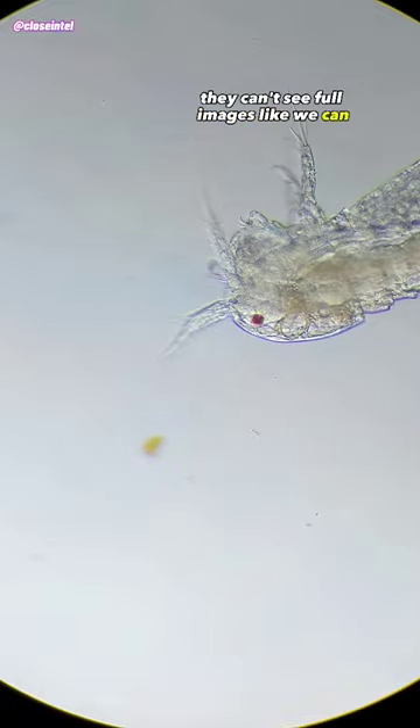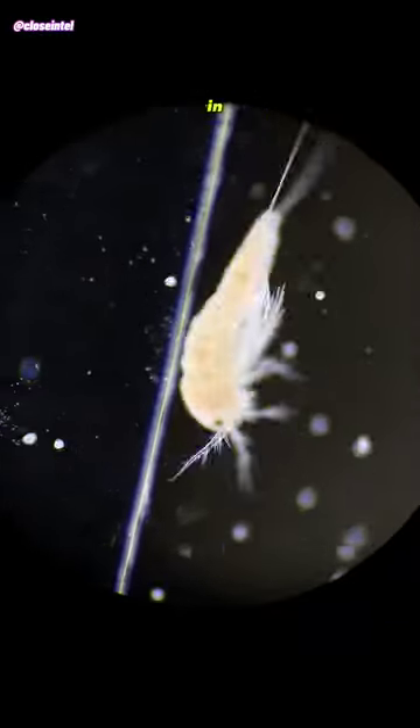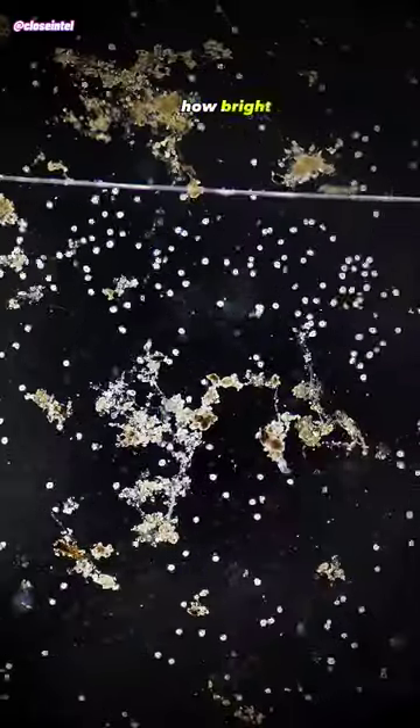They can't see full images like we can, but the eye spot is sensitive to changes in light intensity, and it helps the copepod to detect how bright or dark it is.